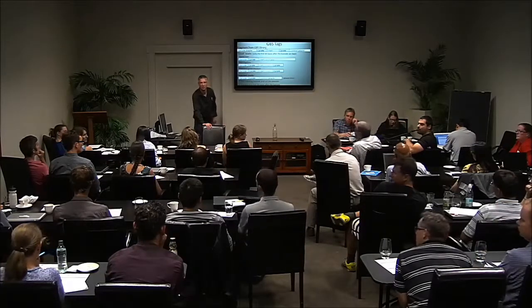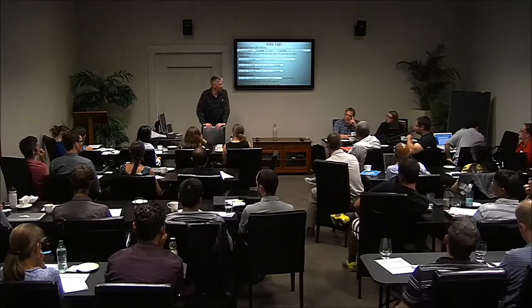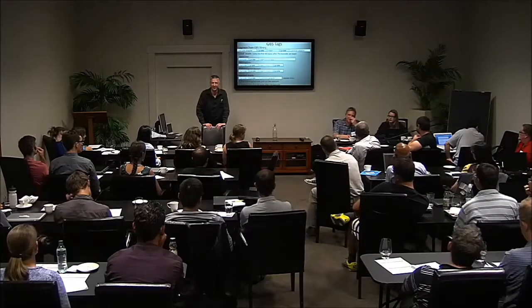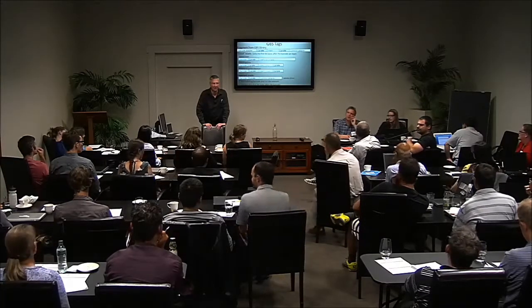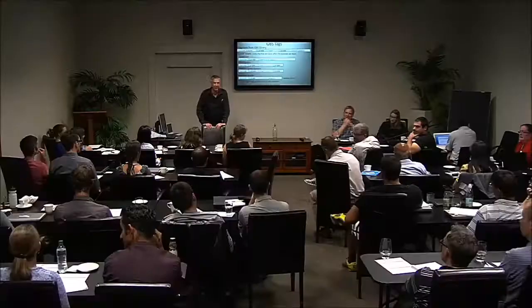I guess what I'm asking is why don't you not even keep anything that's not 64 as a minimum? That's really the question. Well, do you keep 63? 62? 61? I would not keep anything less than 60. Well, you could be creating null alleles though if you do that. Because you could have, at the same locus, some that have a cut site, some that don't. So some tags are 64, some are 60. I've seen that happen. So that's one reason.